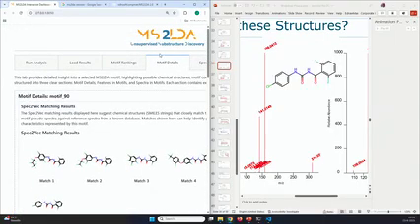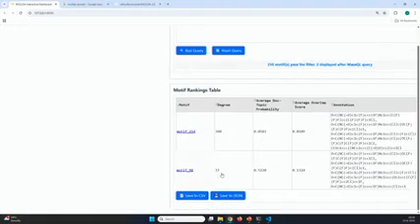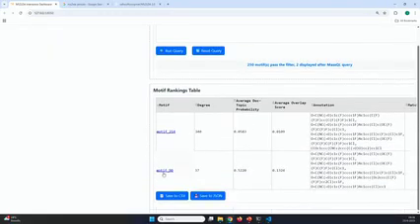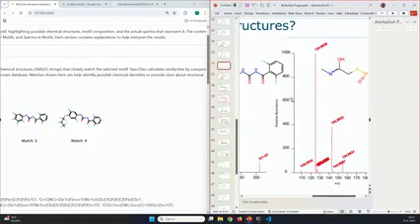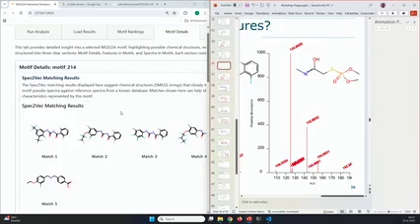So now what I did, I can go back if you want. Here I get two structure recommendations for the MZ value 141. I can click on both, but I know the one I'm actually looking for. But now it doesn't want anymore. Okay, then click on the other one, and then you see the structure recommendations. And actually the plan was, if it had worked, that you would now try to find substructures related to this master motif, and then come back to me and say, okay, maybe it's motif 214 or not.